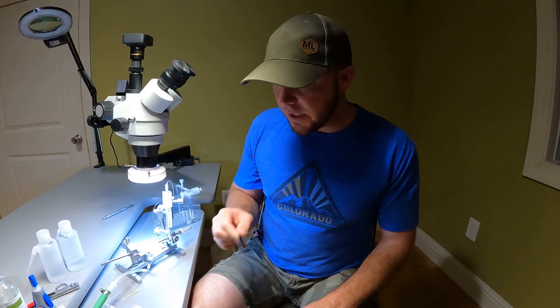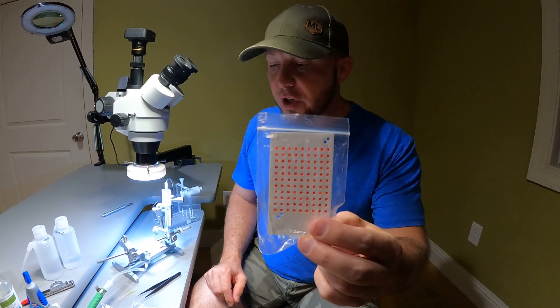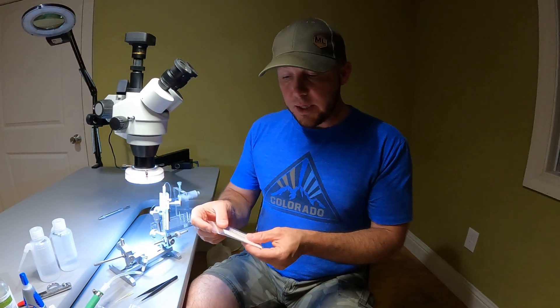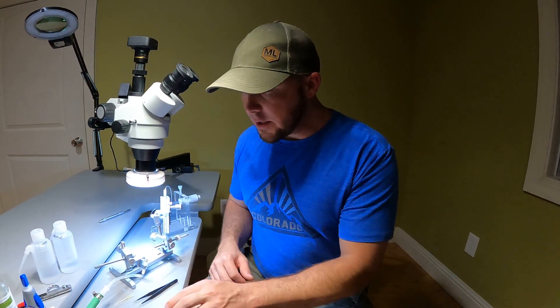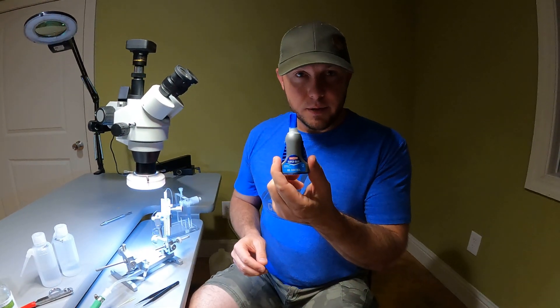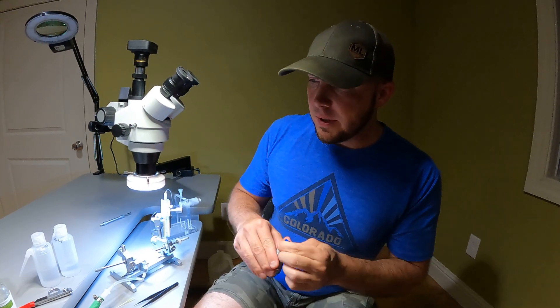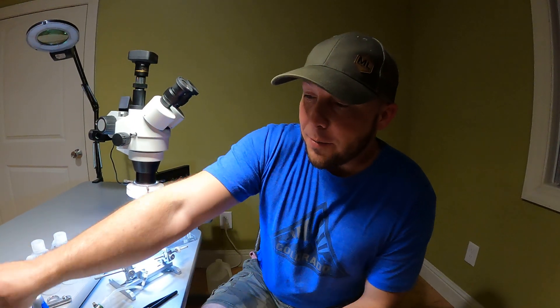Fine forceps are really good for administering these little numbered disks. You'll want to keep records on your instrumentally inseminated queens, so it's easy to number them. To attach the disks, you'll really want some superglue gel. These numbers usually come with some kind of cement, but it's not great — I'd recommend superglue gel, as recommended by Sukovi.